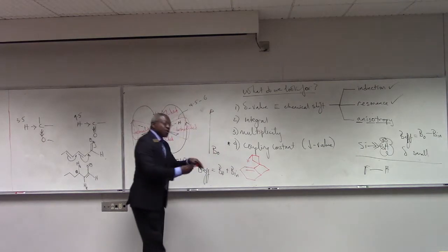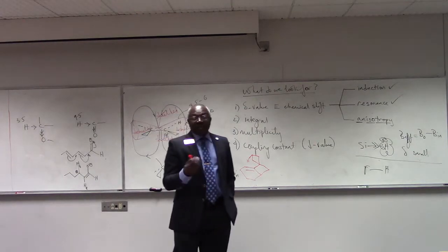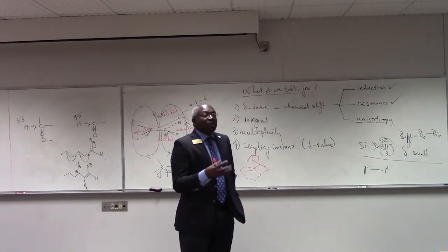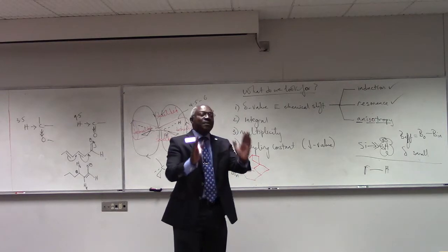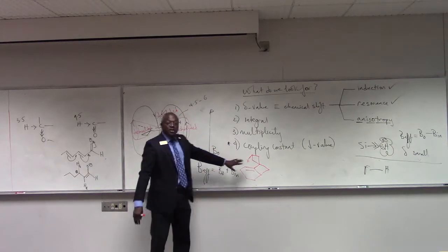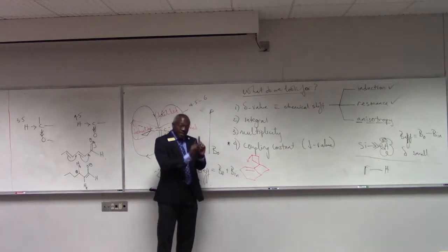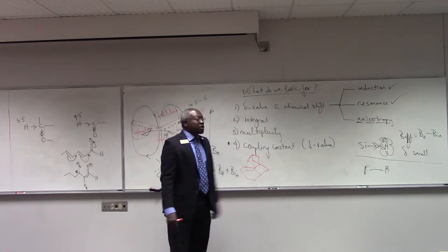So, what you do with the NMR, or for that matter any technique, you kind of need to know what you're looking for in order to best set up the experiment. So you don't want to just go blindly, right? If you live with a rigid vinyl system, you may want to expand your spectral window, perchance an H ends up in a shielding cone.